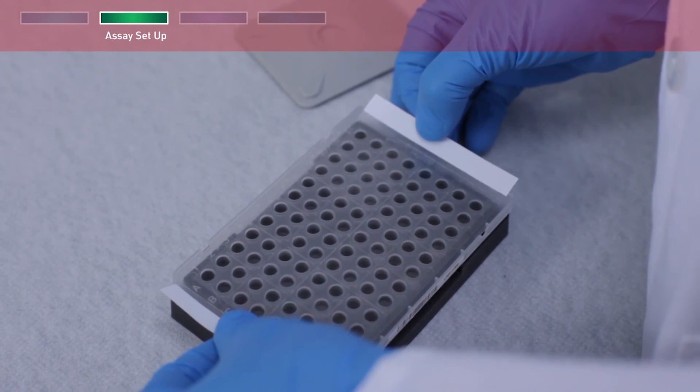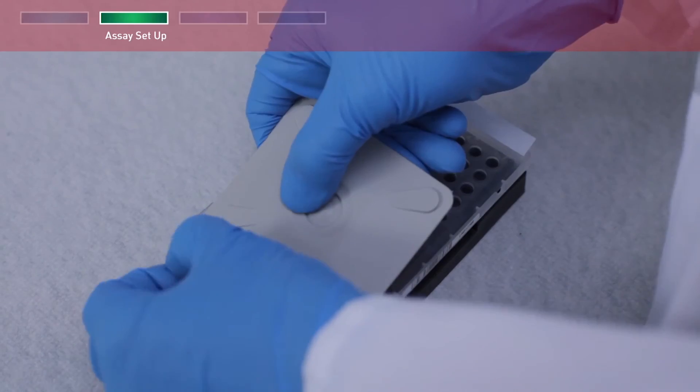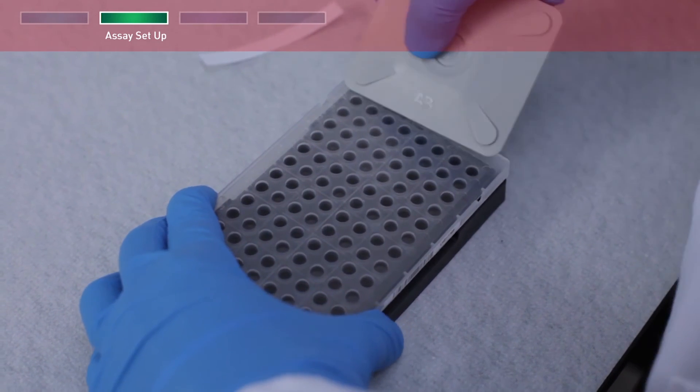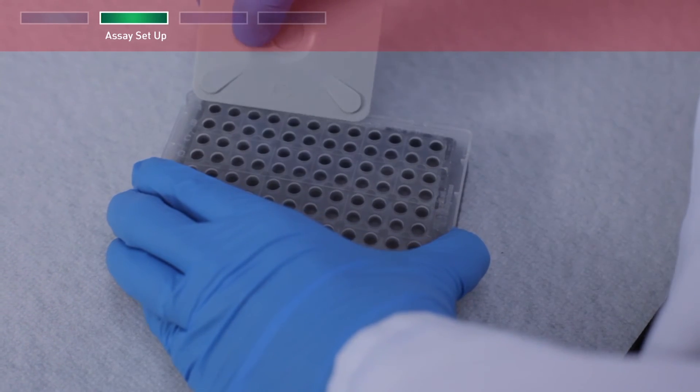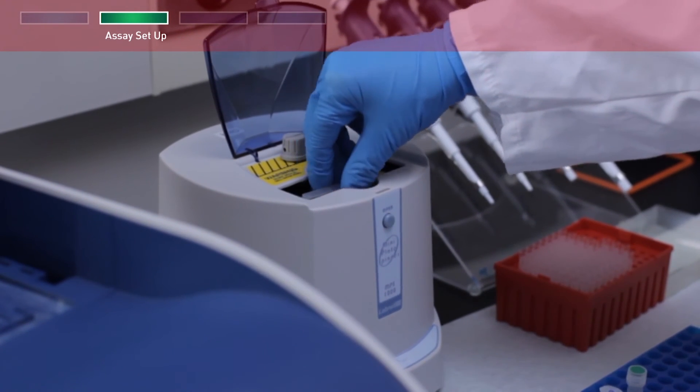Seal the plate with an optical film. Ensure a tight and even seal between all wells and along all edges to minimize the risk of cross-contamination. Then quick spin with a centrifuge rotor that is compatible with 96-well plates.